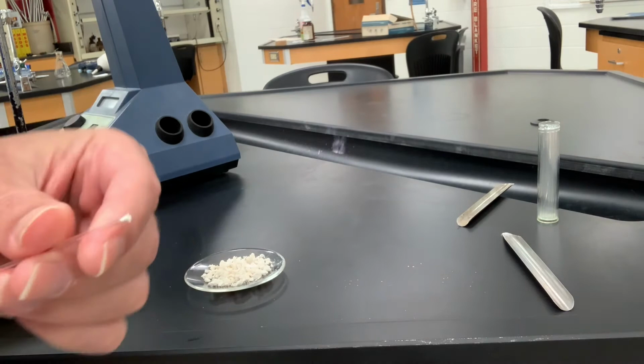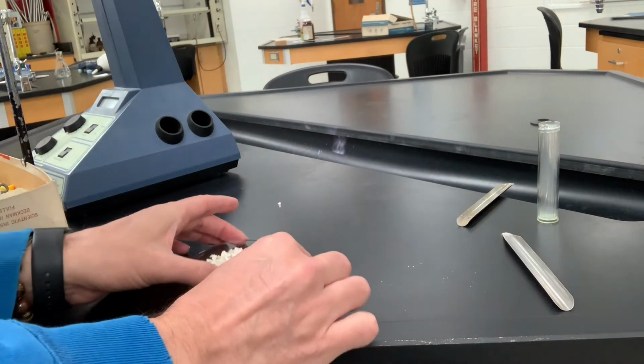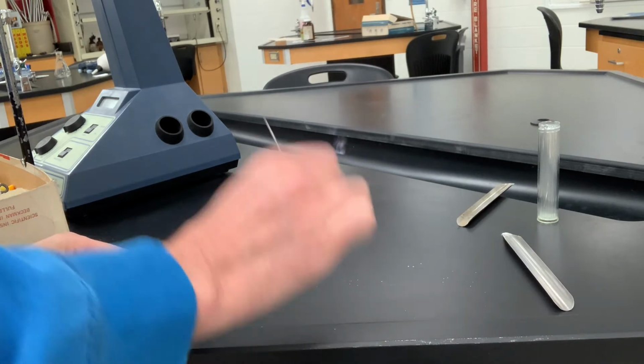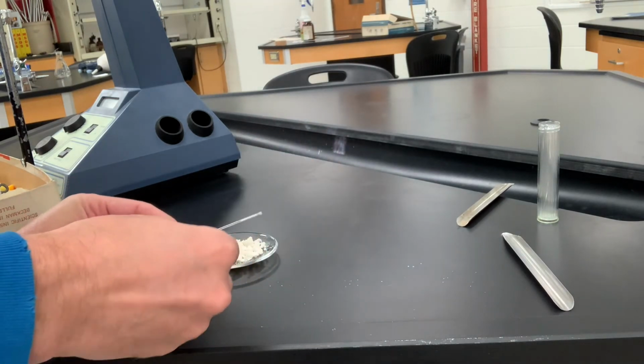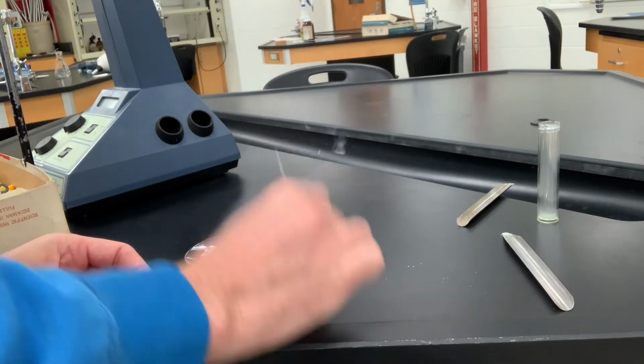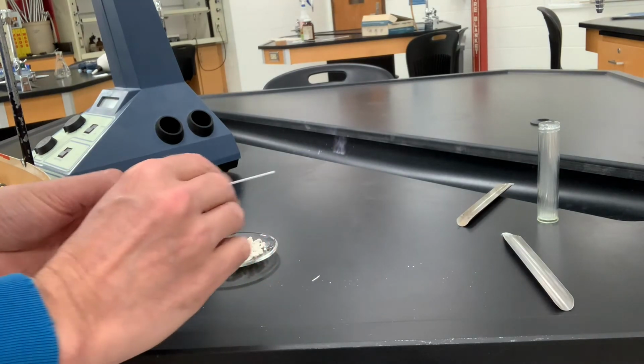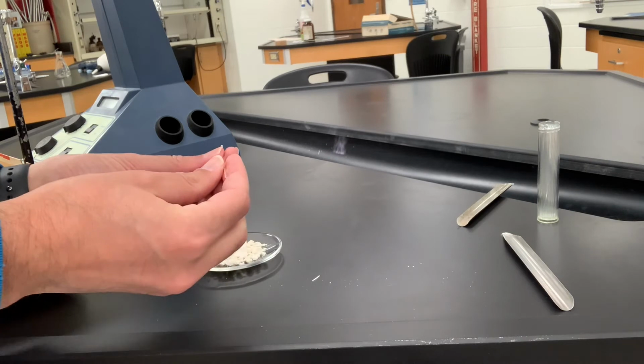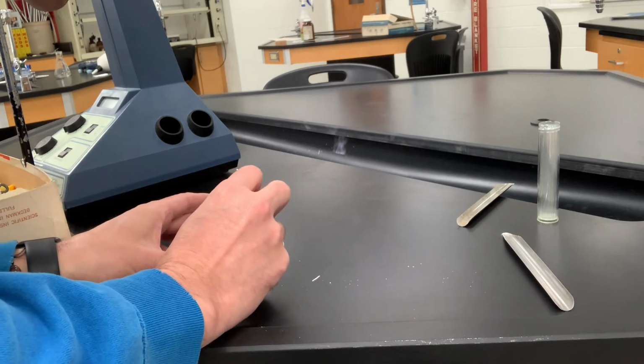As usual, we want about 2 to 3 millimeters depth of material in there. Tap this on a surface. And this is not going down. Don't know if you can see that. It all just came out the top. Try this again.